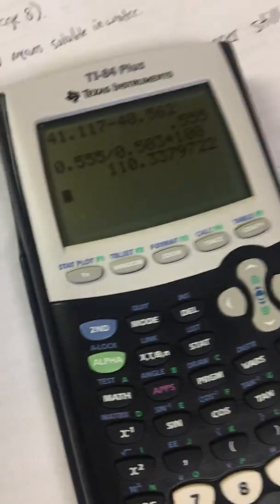So with this, there's experimental errors. Experimental errors could either be greater than 100% or lower than 100%. In our case, the percent yield was higher than 100%, with the result being 110.338%.